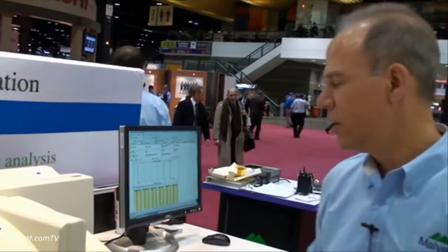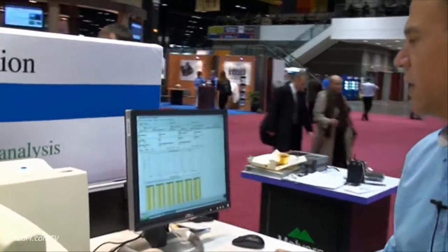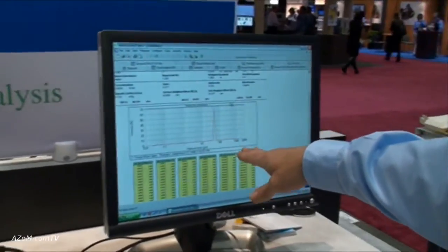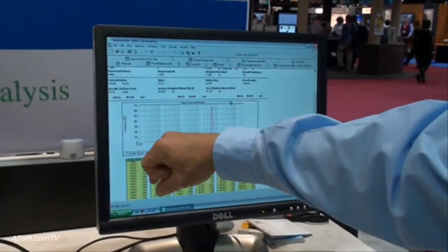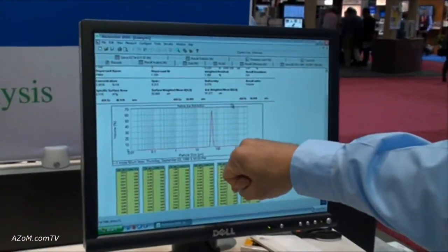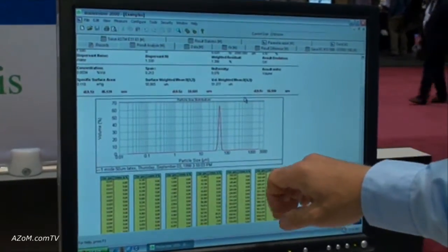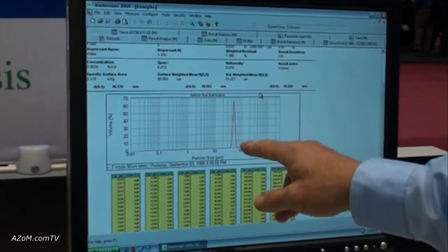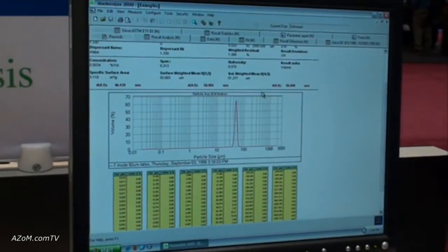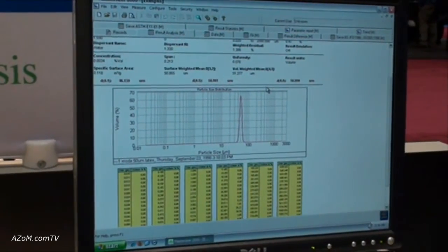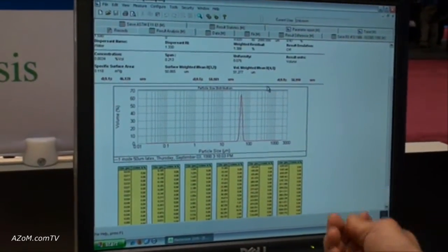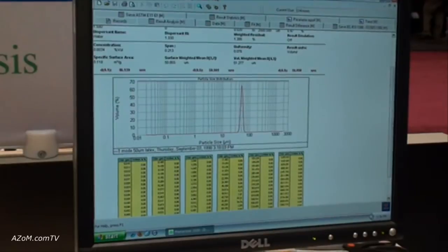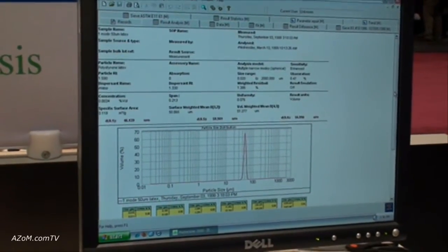Going over to the computer, typically the results are displayed as a particle size distribution. Here you can see the range of the instrument from the nanometer range up to 2,000 microns. In this case, one of our standard type materials is being measured with a very narrow distribution. We typically provide a volume distribution; we can also provide number distributions.